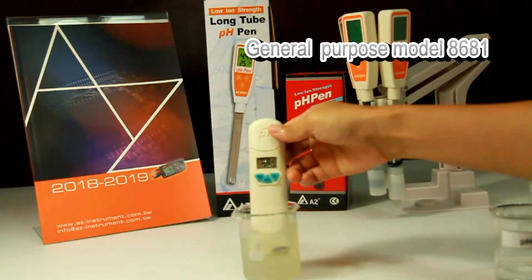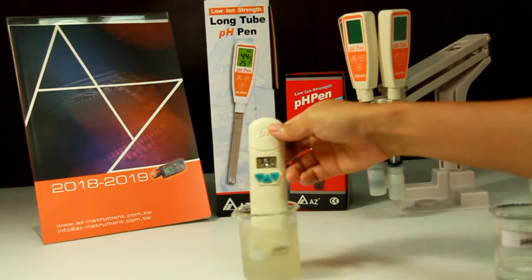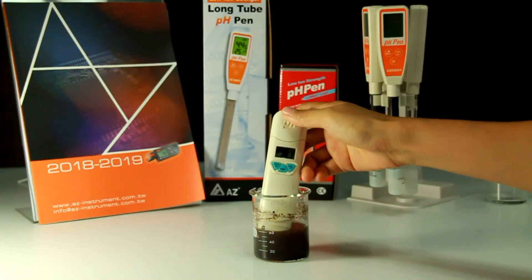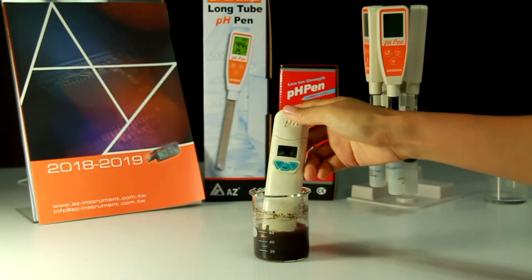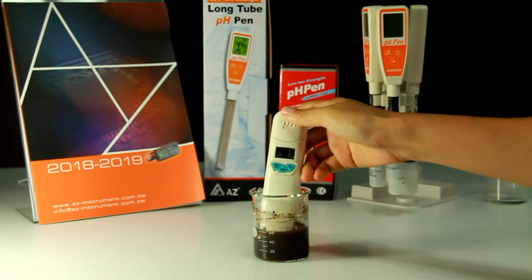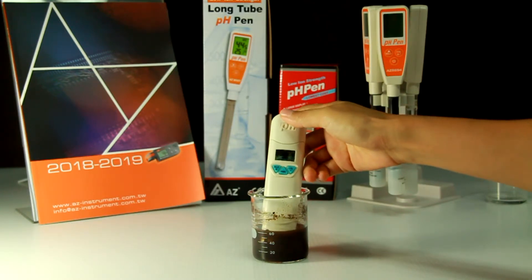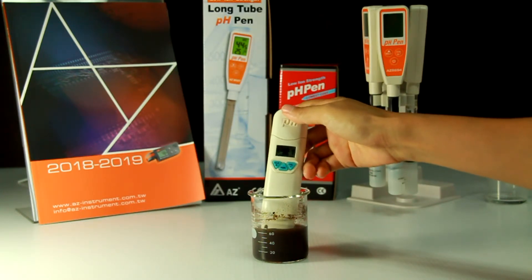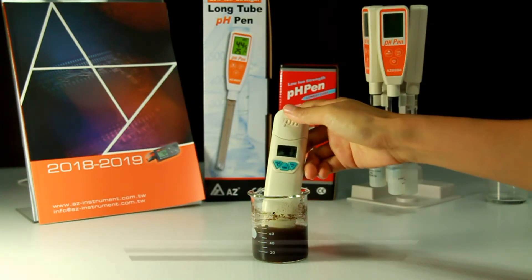To measure the pH value of lemon juice, you may use the general purpose model 8681. If you need to measure the pH value of soil, mix dry soil and distilled water in a 1-to-1 ratio and mix thoroughly. Immerse the PH probe and stir to get a stable reading. Based on the measurement, you can adjust the pH value of the soil to increase plant harvest.